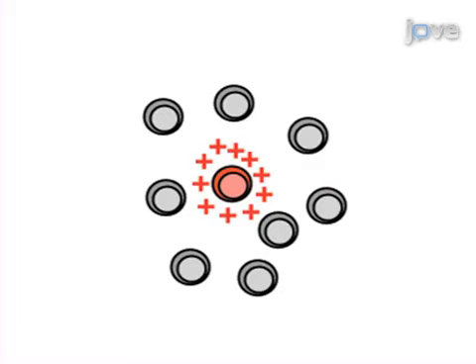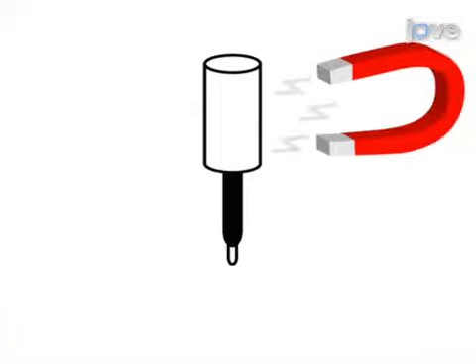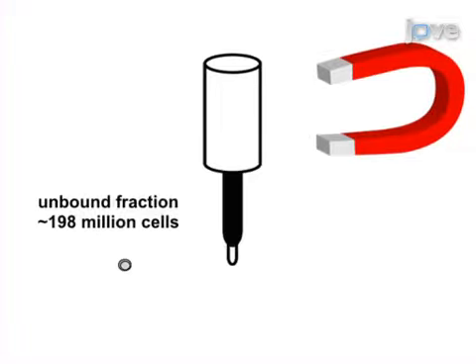These tetramer-labeled cells are then stained with magnetic microbeads conjugated to antibodies specific for the fluorescent tag on the tetramer. Next, the magnetically labeled cells are passed through a magnetized column in order to enrich the sample for tetramer-bound epitope-specific T cells.